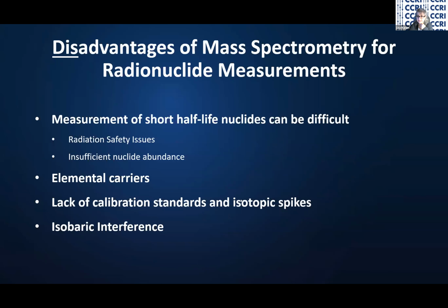So let's see. Any further? So Dante has added a comment. The neutron activation analysis community might have insights into real-time mass spec measurements for short half-lives. Oh, that's a very good point, because they do need to worry about that sort of thing. Thank you. Very helpful.